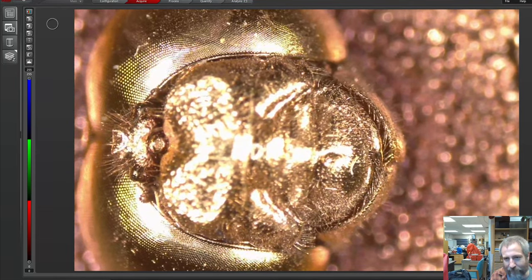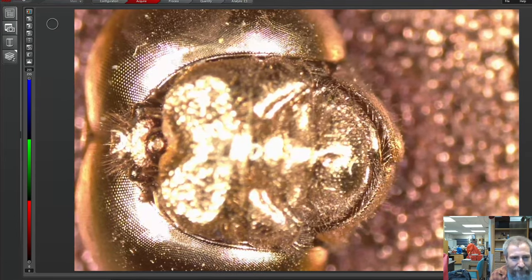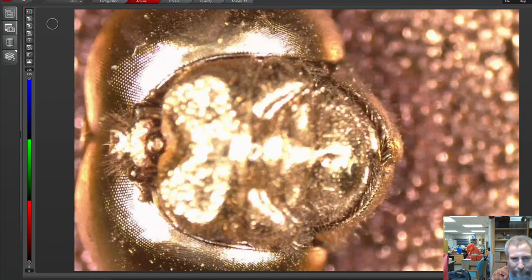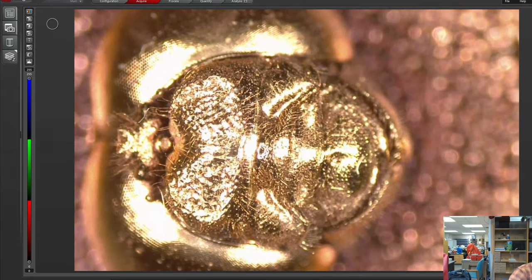So there you can see their jaws, or their mandibles, are basically below their chin, if you want to humanize them. And then they have all these sensors around above that rostrum or beak or front face that they have right here. None of those have moving parts on them.